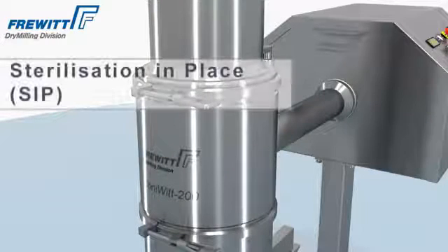In addition, Sterilization-in-Place (SIP) sterilizes the Konivit Mills.